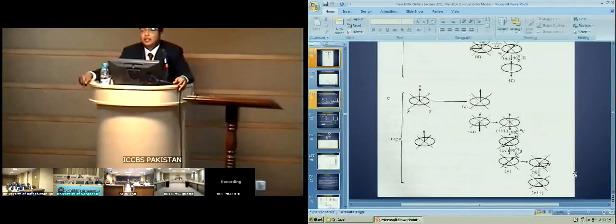Carbon-13 is coherent because it is all on the negative Z, symbolizing the Boltzmann distribution axis. The proton is non-coherent, divided into two parts. The whole Boltzmann distribution axis of the proton is now on plus and negative. And when you transfer this, a part is added into the non-existing part where there was nothing.